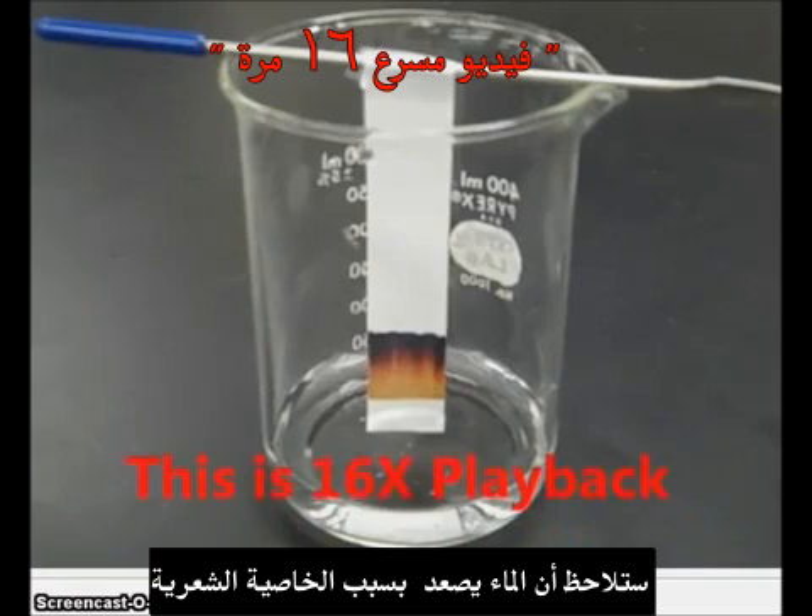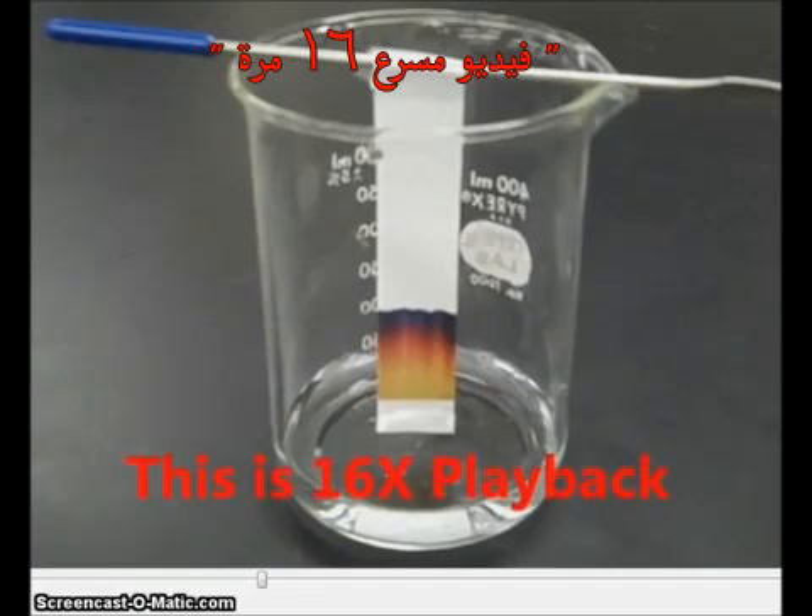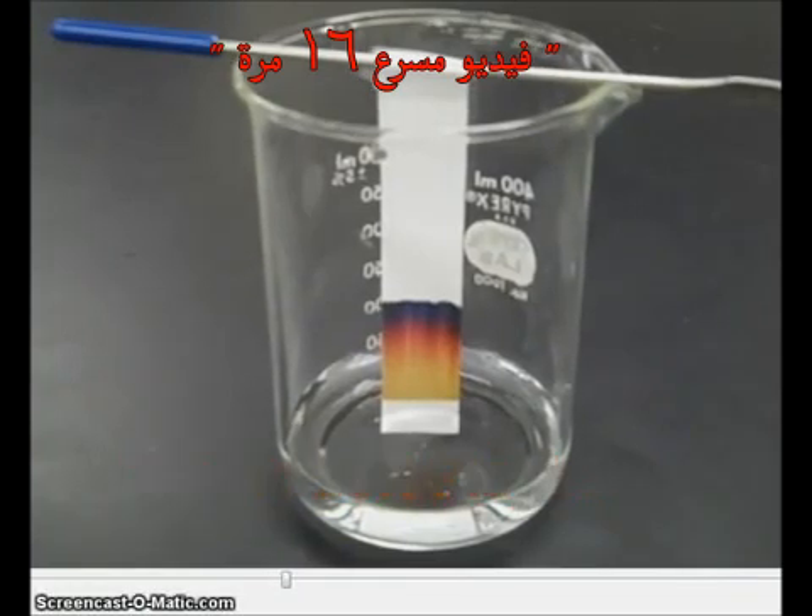We can see that the water will start to rise up the chromatography paper because of capillary action. You'll note this is happening very quickly because this is 16 times speed playback.